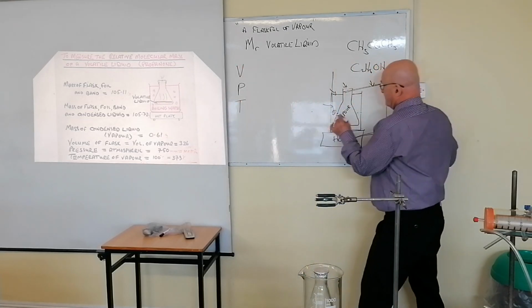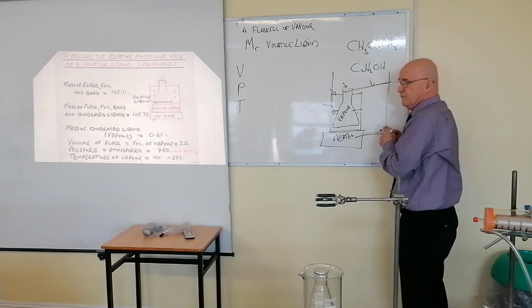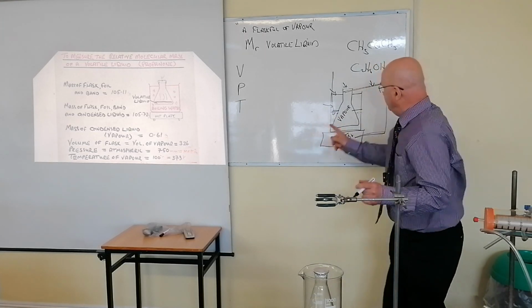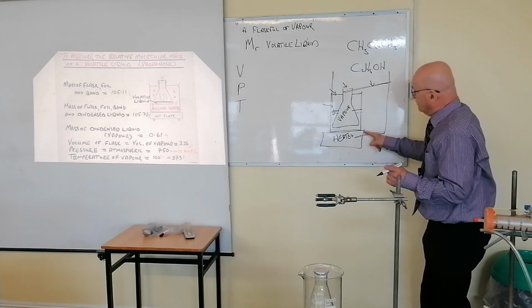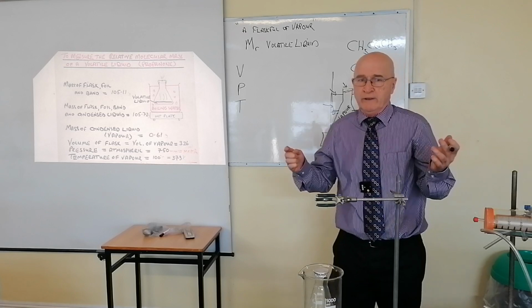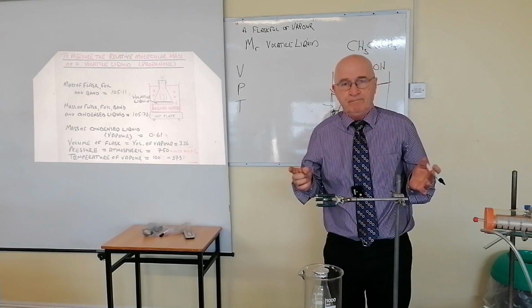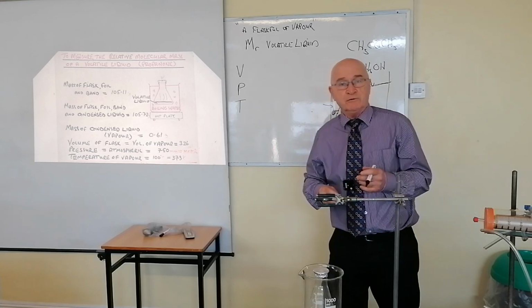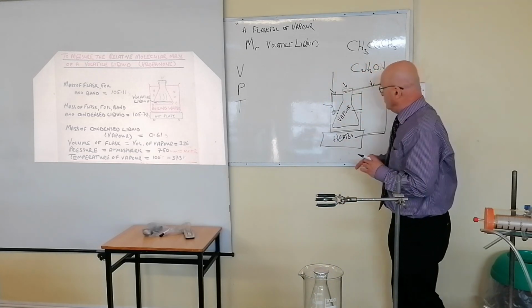And as I say, it's quite hilarious when you find the level of the water down there. You're talking about someone who doesn't know what they're doing. And that would be a serious mark deduction. Now all the others would lead to mark deductions as well. Anyone who has been in my class before knows anyway that you label everything. You assume the reader has no chemistry. And if you do that, you'll do very well. And I'd suggest now that that's the way you're going with that, that's your diagram.